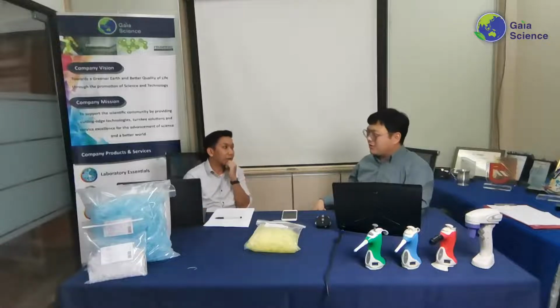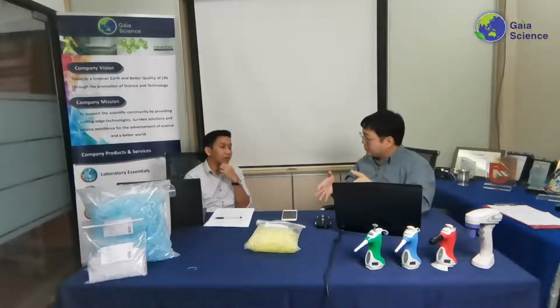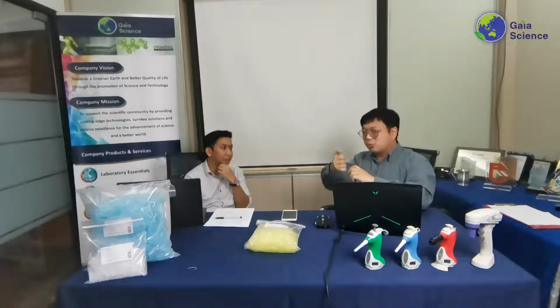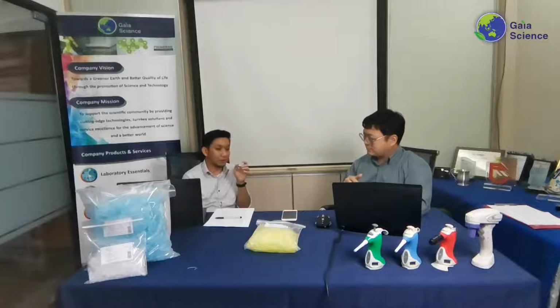Yes, that's right. Or maybe those coming from industry who do big scale work, then suddenly have to go into research level and do small scale as well. So it's possible that they have never held a pipette before. Then the filter tip is like a training tool, where they put it on and make sure they are able to do the aseptic techniques correctly. Again, please watch the videos, because one of the key things Bess mentioned just now is that for those who never used a pipette, they cannot differentiate between the first stop and the second stop.